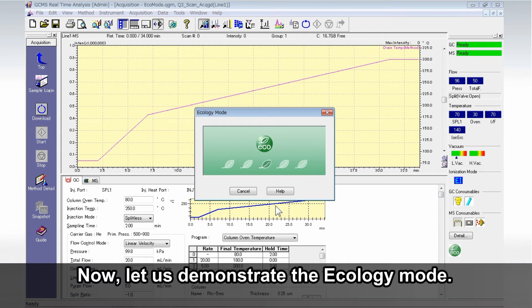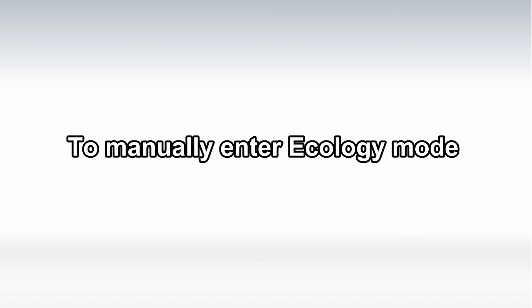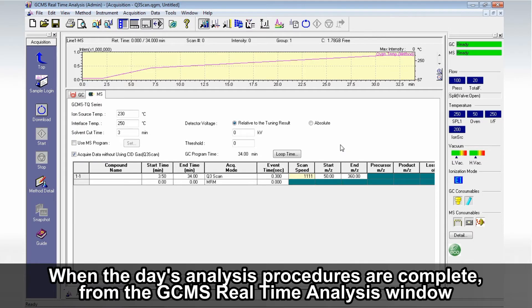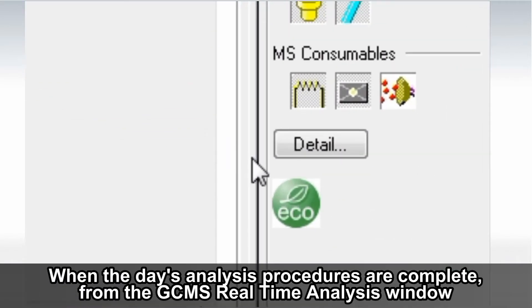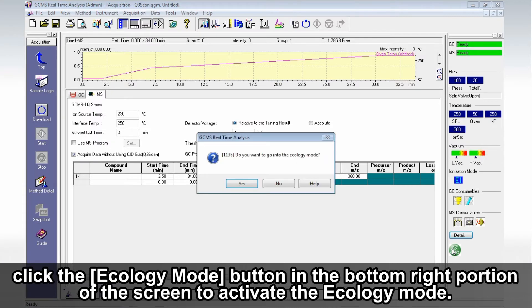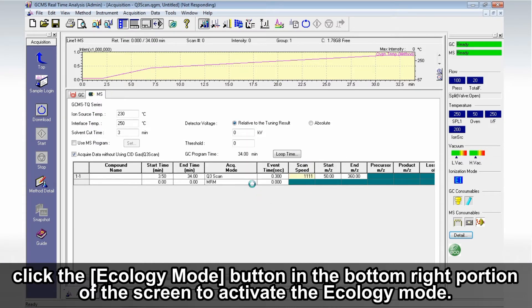Now, let us demonstrate the Ecology Mode. When the day's analysis procedures are complete, from the GC-MS real-time analysis window, click the Ecology Mode button in the bottom right portion of the screen to activate the Ecology Mode.